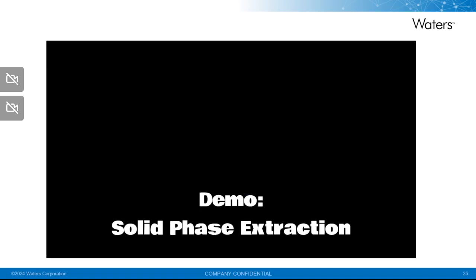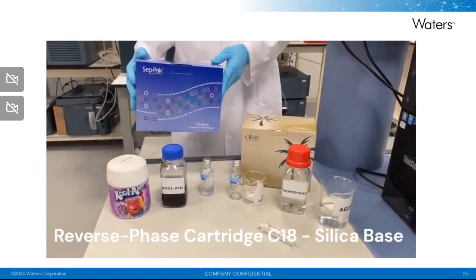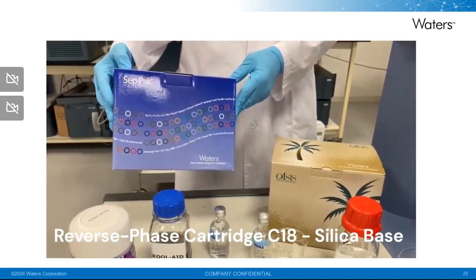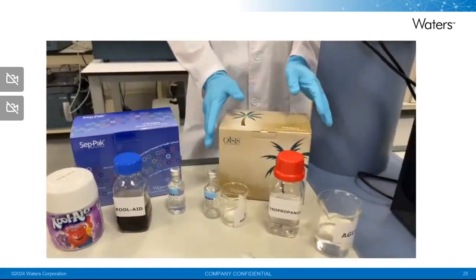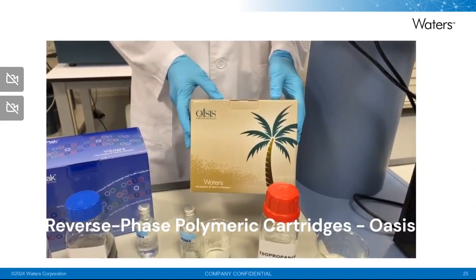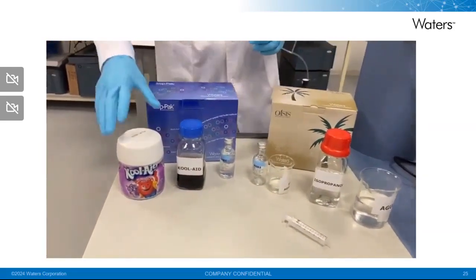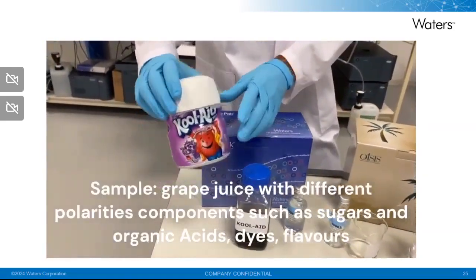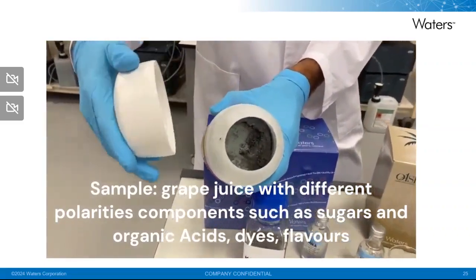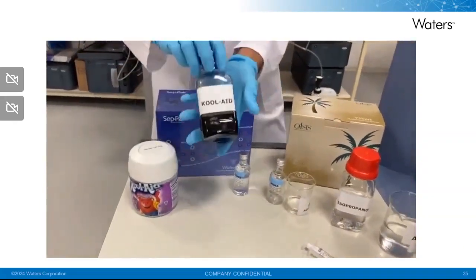In this video, we're going to be demonstrating the work with reverse phase SPE. We're going to be working with Sep-Pak C18 reverse phase silica-based cartridges, and we're also going to be using the Oasis reverse phase polymeric cartridges. We're going to be working with grape juice as a matrix. We have here the powder, and this grape juice powder contains components of different polarities such as sugars, organic acid, dyes, and flavors. And this is just a powder dissolved in water.